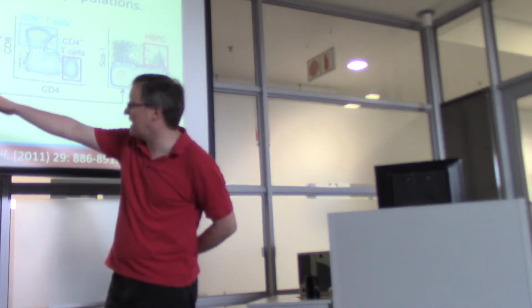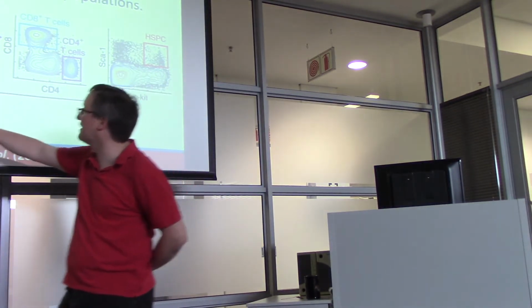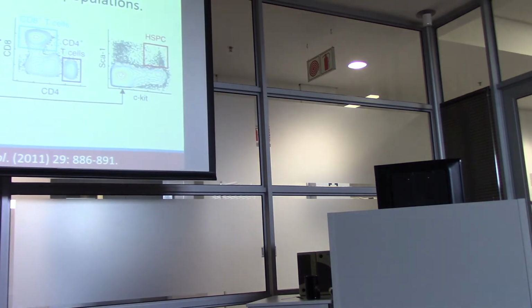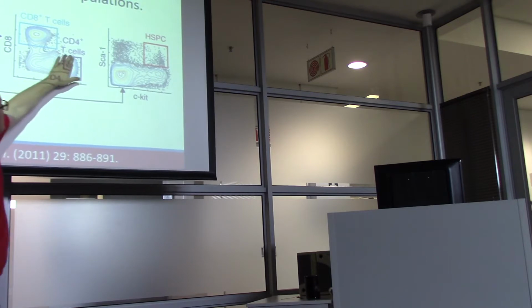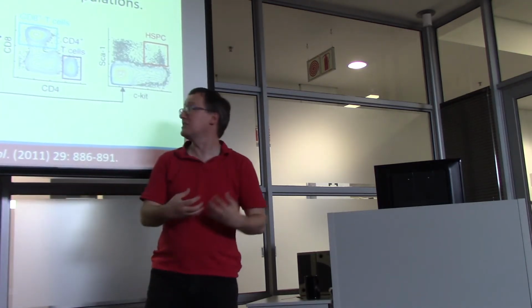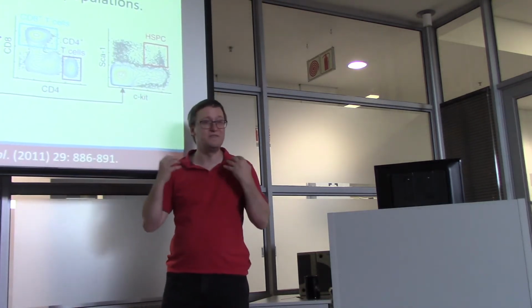So in this first stage, we're going to separate from all myeloid cells, this particular population of them. Any cell that passes this rule can then be passed on to this second rule. In this case, we're going to pull out these cells for consideration down here on those two axes. These T cells, on the other hand, we're going to separate on CD8 and CD4. So that these are the CD4 positive T cells and these are the CD8 positive T cells. So we're going after 1, 2, 3 minority cell populations, plus these B cells, I guess, 4 different cell populations, by using a combination of different markers.